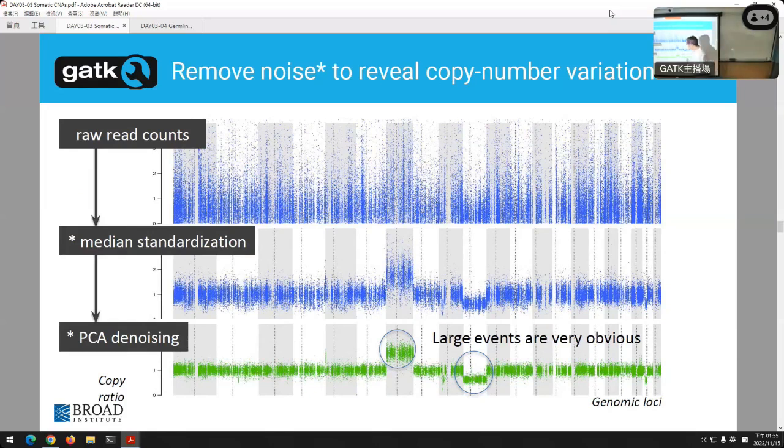The way to read these plots, by the way, is this is chromosome 1, and then it changes color to 2, 3, 4, 5, 6. So right in chromosome 7, most of chromosome 7 here looks to be at copy ratio, probably 2. Okay, so copy ratio 2 means how many copies of chromosome 7 are there? A little bit of math. Aaron has the right answer in the back. You're cheating. So come on, someone yell it out. Copy ratio 2 means there are how many copies of chromosome 7? No one. Thank you. Just 4.